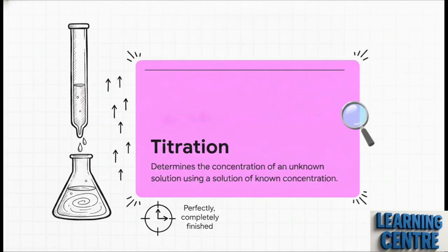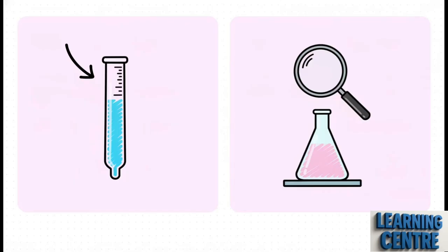It's like a balancing act. We are slowly, carefully adding the known chemical to the unknown chemical until the reaction between the two is perfectly, completely finished. Let's lock in some crucial terminology right now so we don't get mixed up later.